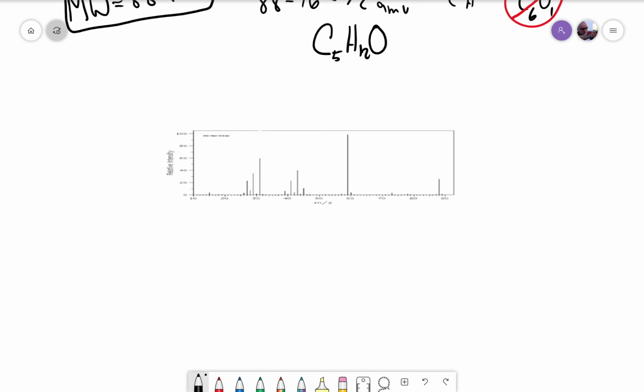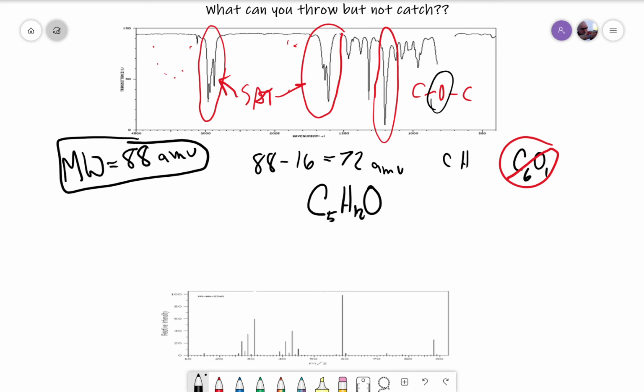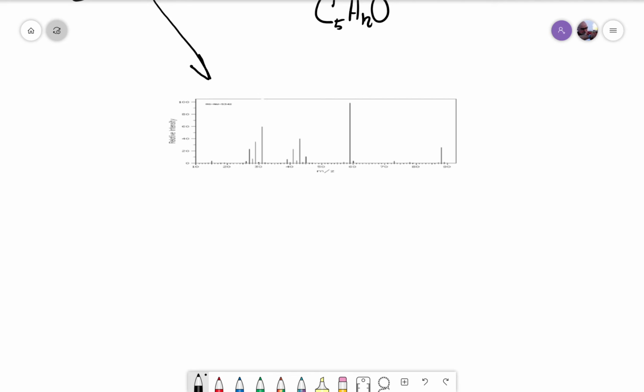If we look at taking that same sample molecule and then putting it in a mass spectrometer, then we might have the IR and the mass spectrum. The purpose of the mass spectrum is first and foremost to determine the molecular weight. The empirical formula, that would be a bonus. If we look at the mass spectrum, the first thing we need to remember is that the mass spectrum will contain a number of different peaks in the spectrum, even though there's only one molecule. Those peaks are coming from the intact molecule, hopefully, and many of the fragments formed by the ionization process.